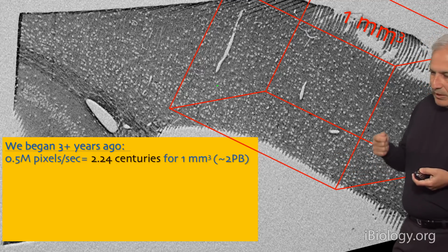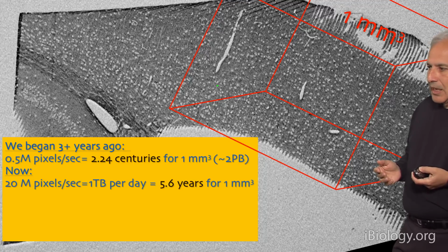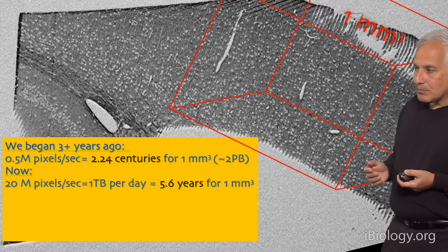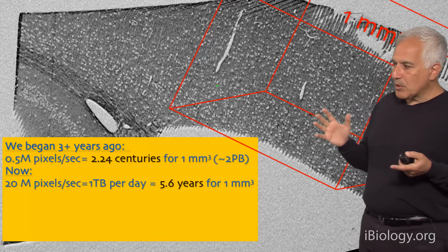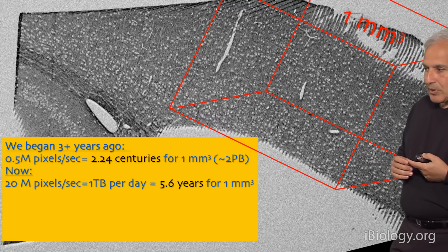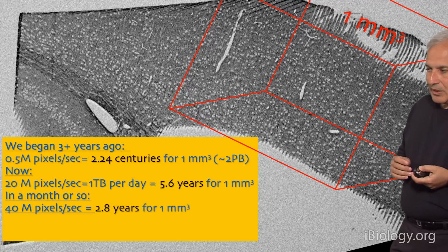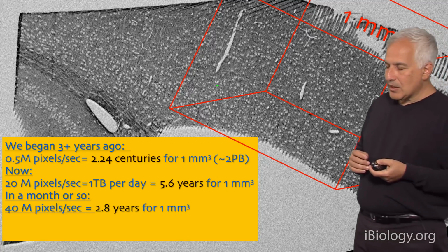So since then, we've been optimizing the imaging techniques to go faster and faster. At the moment, we go about 20 million pixels per second, so 40 times faster. And we can do about a terabyte a day. And we can do a cubic millimeter of data in 5.6 years. We just have a new machine delivered that goes about 40 million pixels per second. And so eventually we hope to be doing a cubic millimeter in 2.8 years.